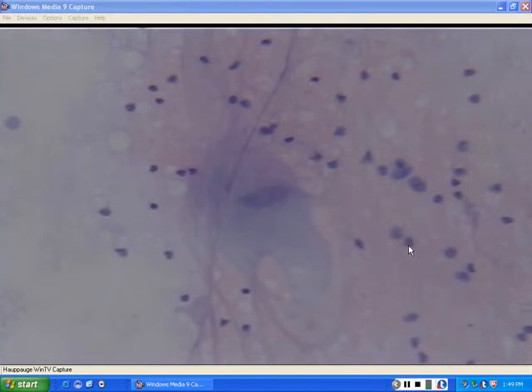And now we come to our last tissue that we discussed in all the histology section. This one is nervous tissue. It's a pretty straightforward and pretty simple to understand and see tissue. We can see at least a very faint neuron in the middle, the kind of globby looking purple that's a little darker and wider. You can see the major cell body of a neuron there. It is very difficult to find them floating around in here because it's just not always found. But the neurons will show up as being much darker.